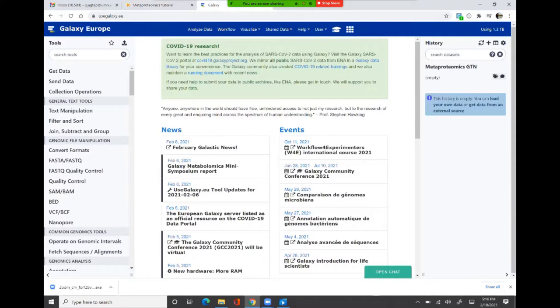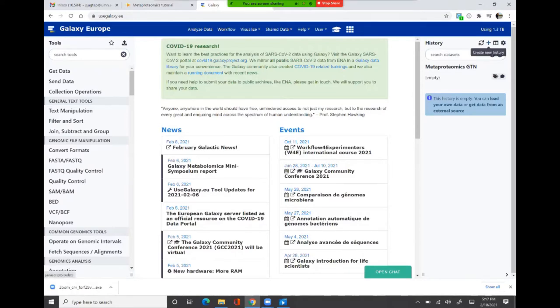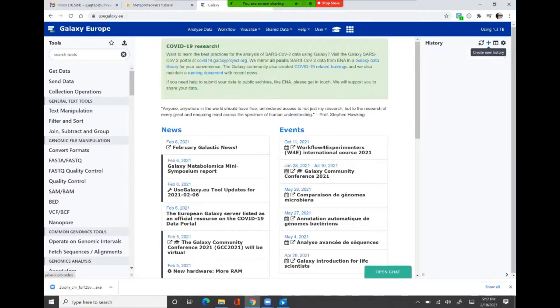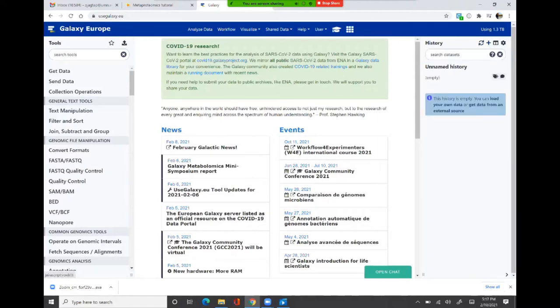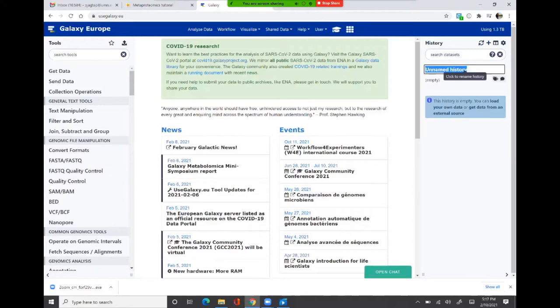Next, we will go to the Galaxy EU website and start by generating a new history so that input datasets can be transferred into it. To do this, use the plus sign and click on it — it generates a new history, which is unnamed. You can name it 'Metaproteomics GTN', for example.